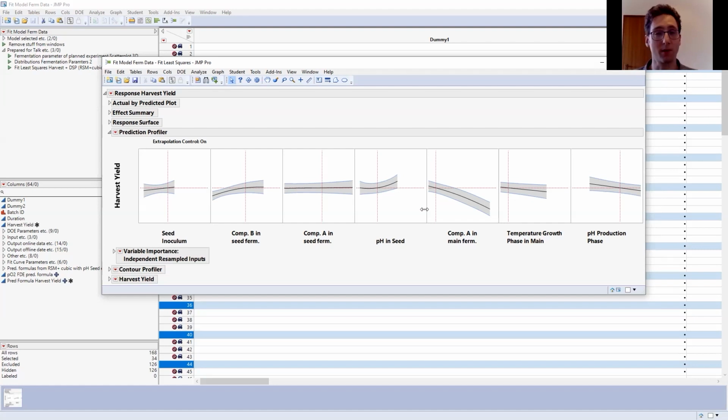You have to put more data into your model, for instance, online data. You're going to see that in a different sensor. That is something I will show you when we go into the online data analysis. You can exactly see this behavior there. And seeing this was quite obvious for me. An explanation of that was clear.